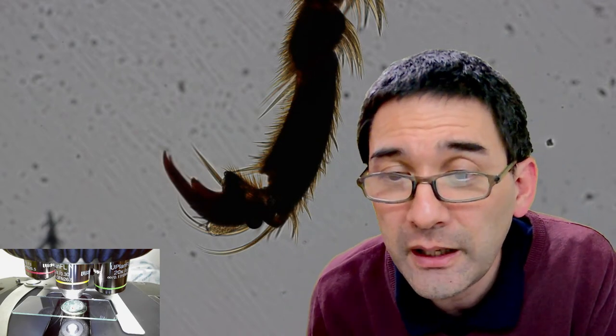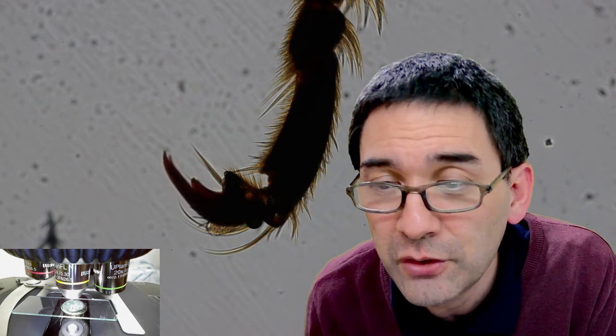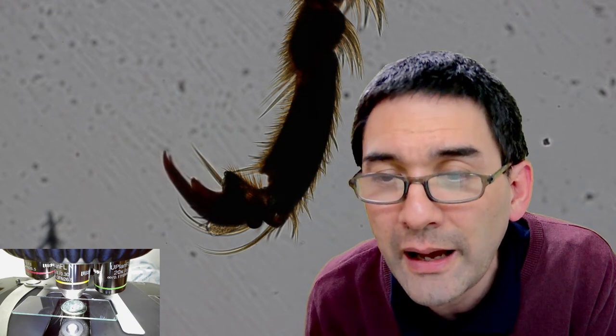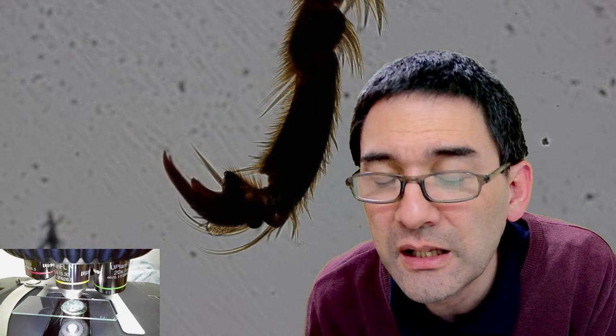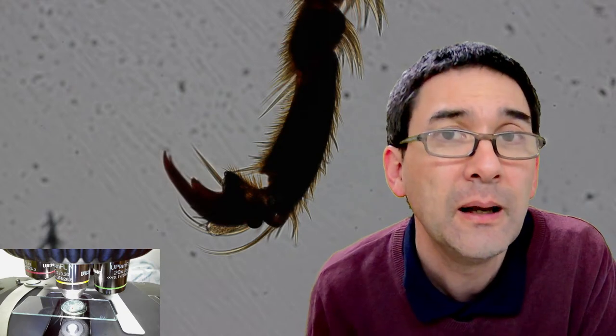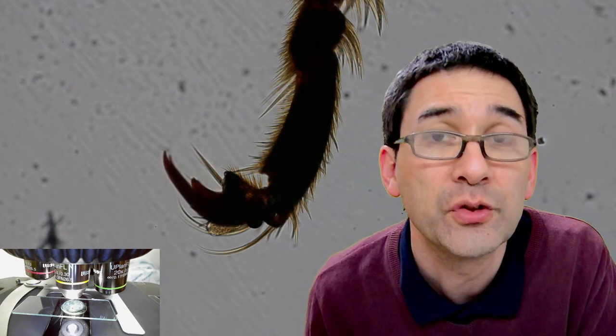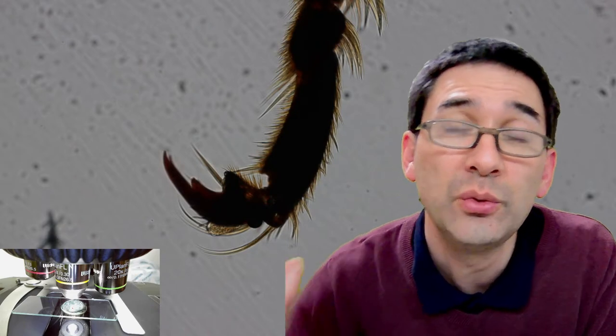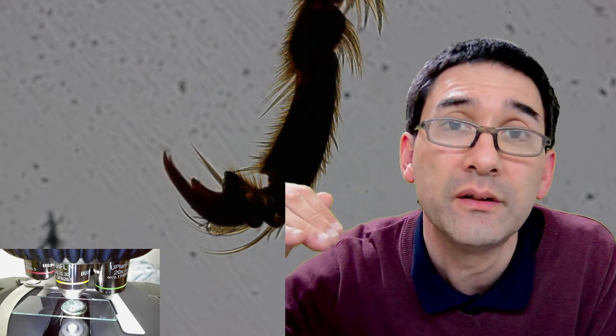Okay. Okay, then there are lots of thank yous here. Would you have to use a cover slip on Euparal, or could you put it under the microscope after it dries? Would you have to use a cover slip? Or could you put it on after it dries? I suppose what you mean is can you dry it without a cover slip? If this is the question, then I would say, of course you can do that, but then the surface is uneven, okay?